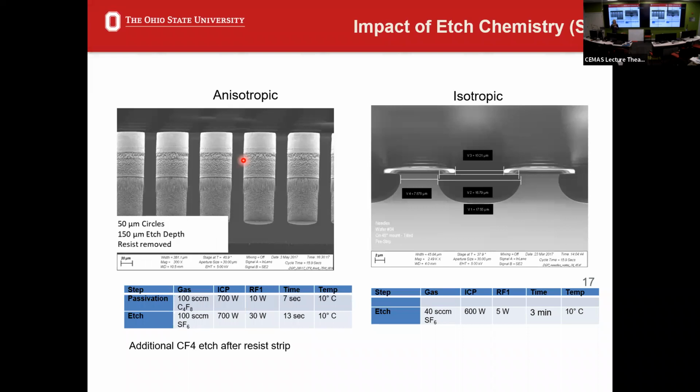This is sort of the opposite side of that biomedical device where they had the nanochannels on one side, and these are the microchannels on the other side, and they're supposed to hook up. What we're trying to do here is we want an anisotropic etch, which means that it's etching just in one direction and not the other. So we want to etch down, but not laterally. The one on the right is an example of an isotropic etch.